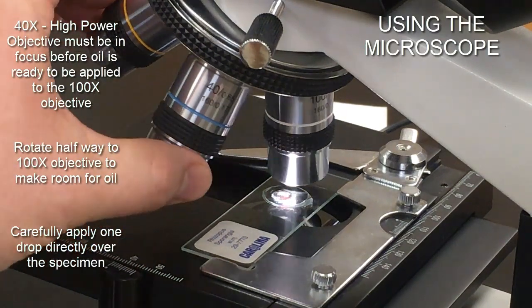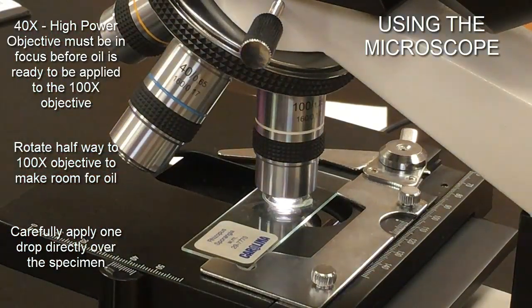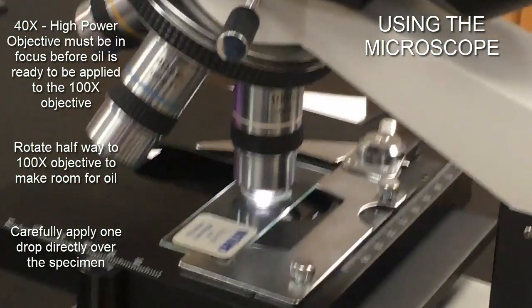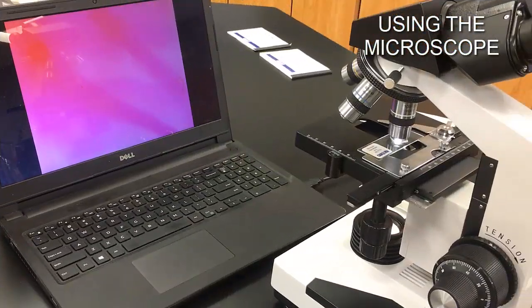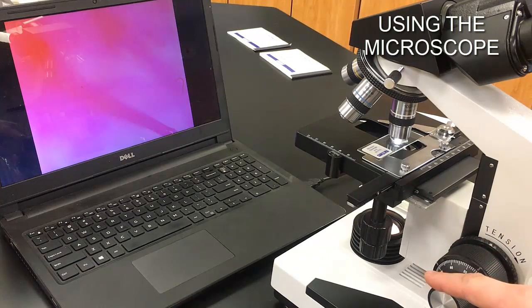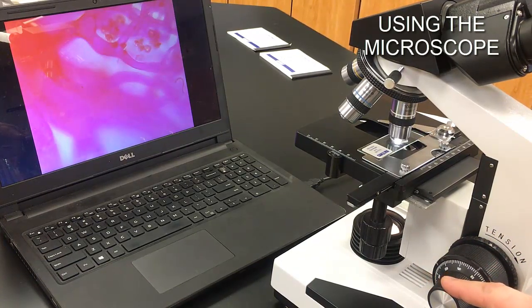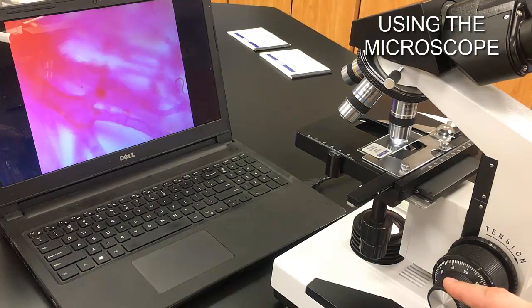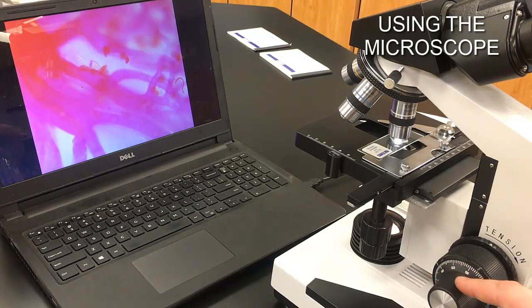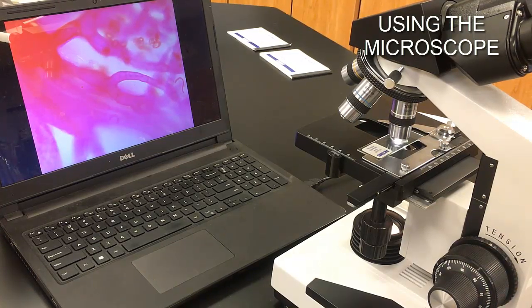Once the 100x objective clicks into place, only use the fine focus knob to bring the image back into focus. Our microscope is parfocal, so a slight adjustment with the fine knob brings the image back. You'll still have different depths to focus through. This gives us the highest magnification power available — 1000x with these particular oculars — which requires that immersion oil.